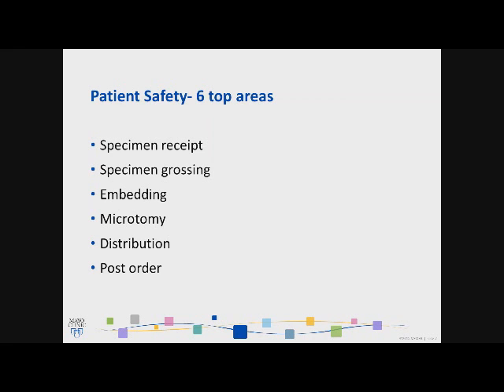We need to go back to this: if you continue to do the same thing over and over again, you're going to end up with the same results. We need to focus on the processes behind the errors. When I gathered samples, we would take the sample directly from the surgical suite, accession it as quickly as possible, write on the blocks, and get it to the, I'm sorry, we say consultants here at Mayo Clinic. Previously, we'd say pathologist. So we'd get it to the pathologist.